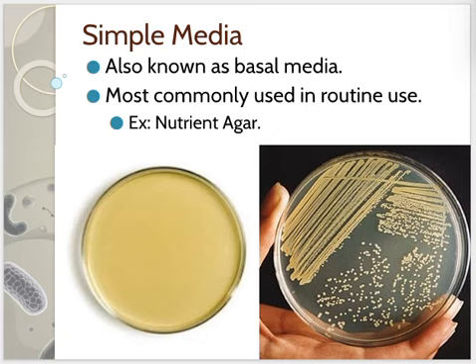Let's talk about simple media, also known as basal media. These are the most commonly used in routine lab work because they provide basic nutrients needed for many bacteria to grow. A good example is nutrient agar, which supports a wide range of bacterial species. Simple media are straightforward and effective for general cultivation, making them a staple in microbiology labs.